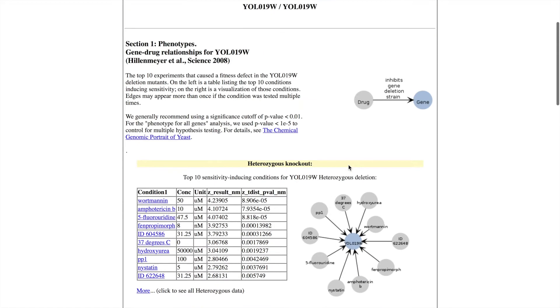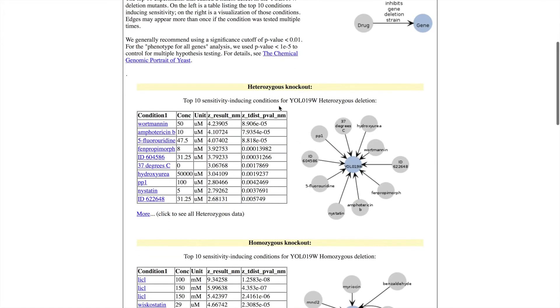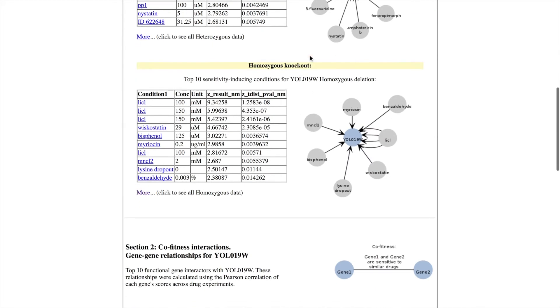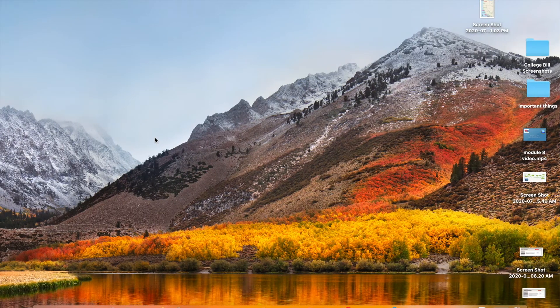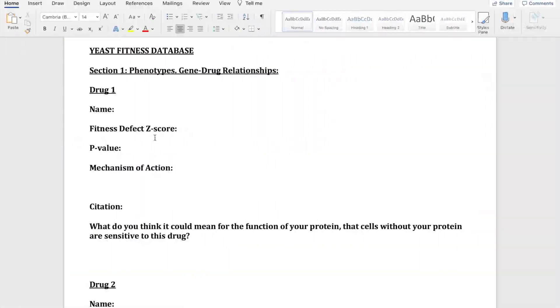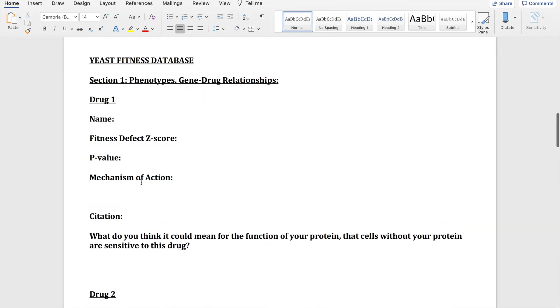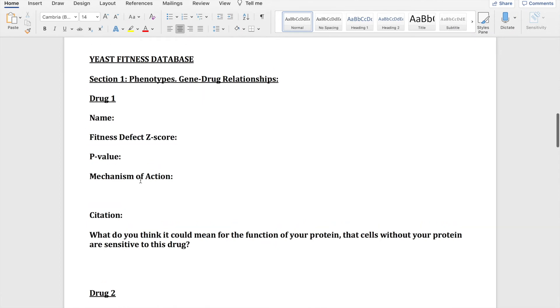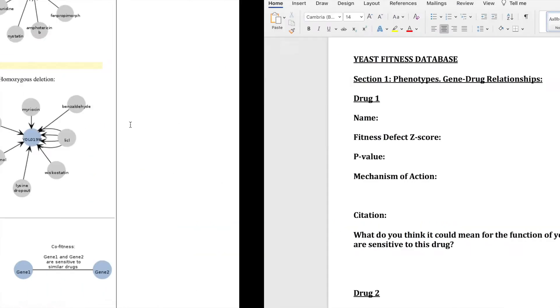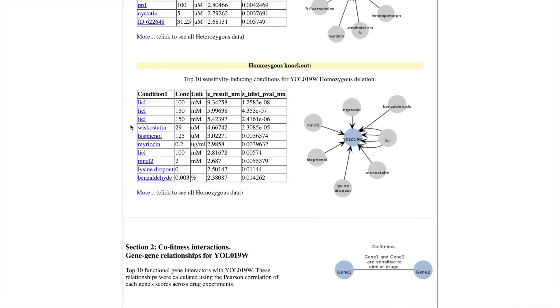What we're going to be looking at is not the heterozygous knockout section but the homozygous knockout section, and what we're going to use in our worksheet is based off of the p-value. We want a p-value less than 0.05.